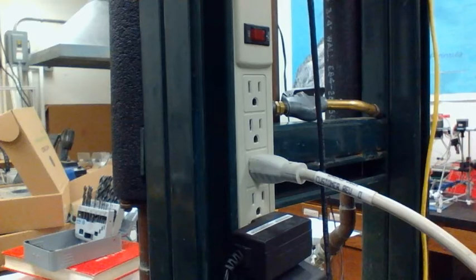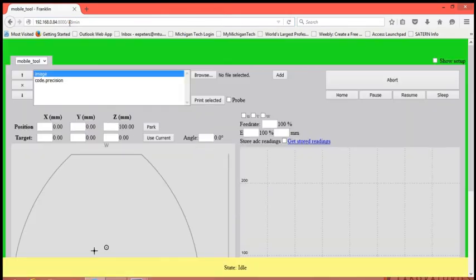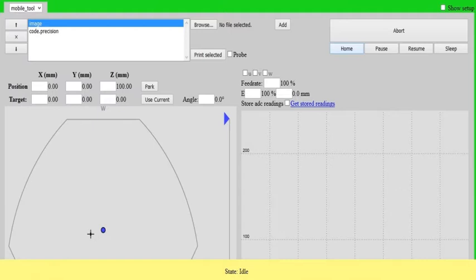The 3D microscope movement is controlled by Franklin and runs on the MELSI and the BeagleBone. This is accessed through a web browser. First, we will make sure our microscope is plugged into a power source. Next, open Firefox to access the Franklin interface. In the top right are control buttons and below that is a graph for temperature sensors. These are only used when Franklin is controlling the wrapper app in the function of a 3D printer. For the microscope, this graph will remain empty.